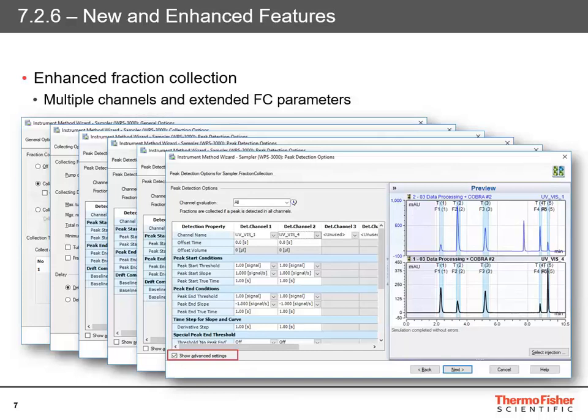It's much easier and quicker to get your fraction collection working as you would like, rather than having to do lots of injections and seeing what happens. That's a really nice enhancement to the fraction collection.